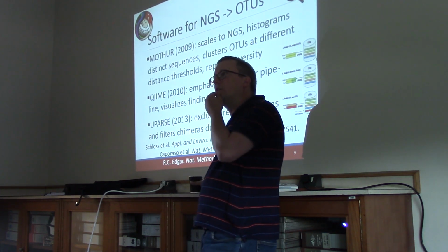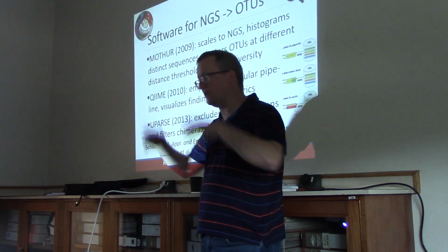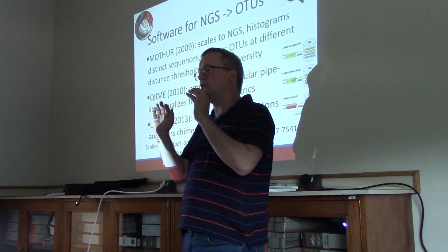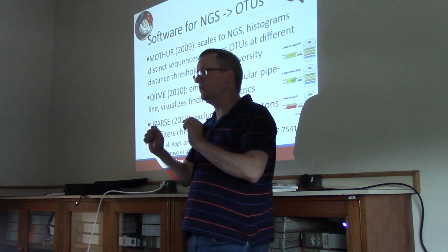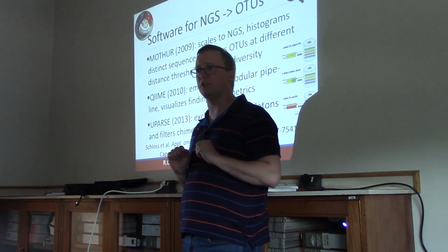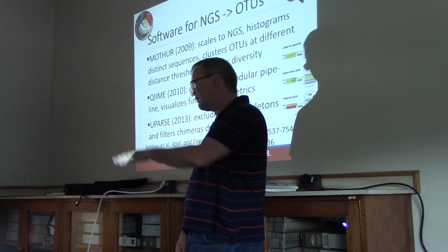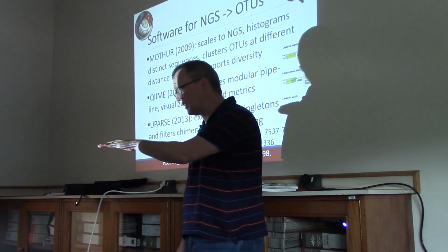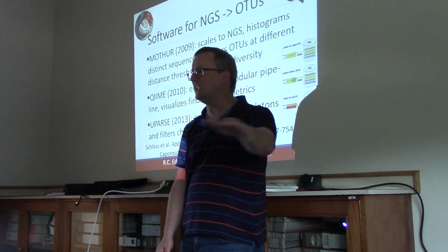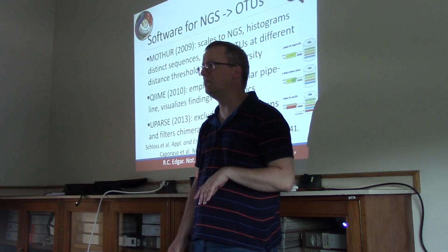They wanted to use kind of a histogrammic approach, that if you are looking at a particular, say, V1 region or V3 regions, you could ask, how popular is each of the sequences that I've produced in this particular variable region? So what would that look like? Would you expect that every sequence you see for a particular variable region would be distributed evenly from the most common one to the least common one?